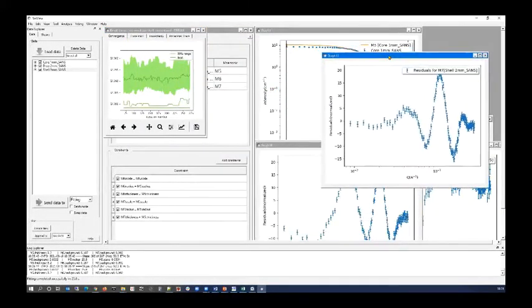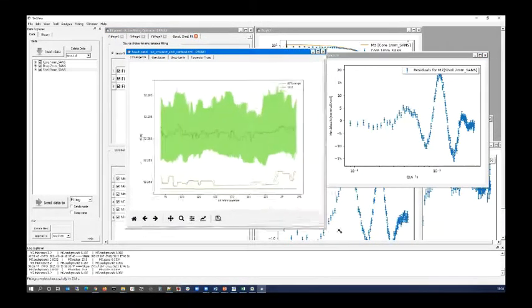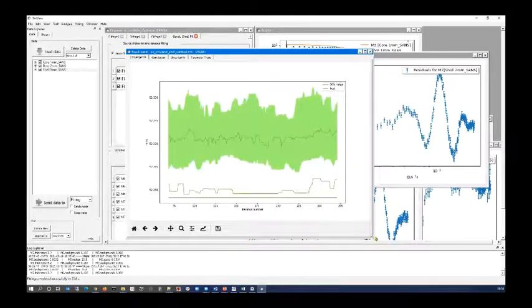So because it's re-optimized things, it brought back all the residuals plots. But what I want to show you is this results panel that comes back from Dream. This is only available if you use the Dream optimizer. It has 4 tabs in here. So this first one is showing you how the convergence has progressed as Dream was doing its job.